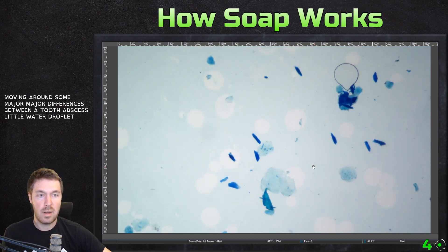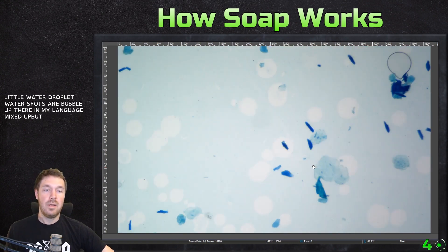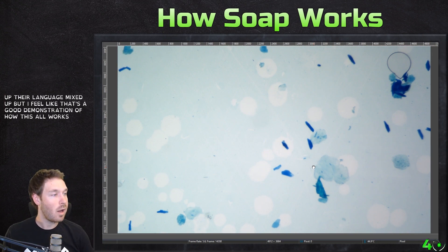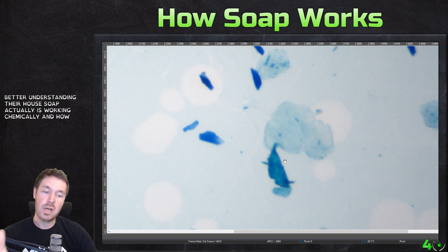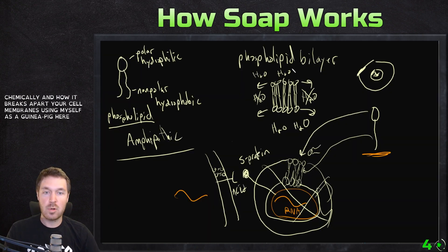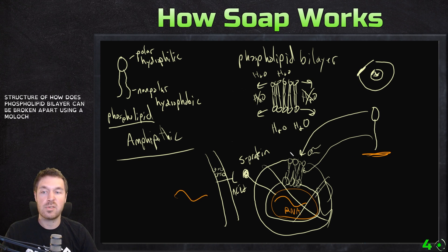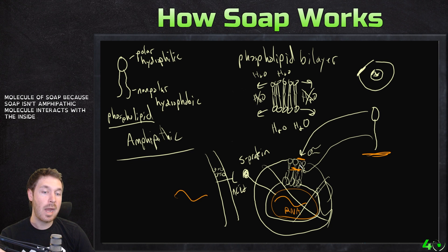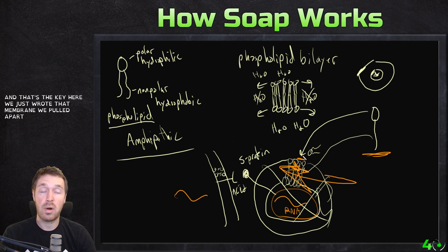I don't see stained nuclei in there as well, which could be disrupting the methylene blue. But if I go deeper into this stained sample, we then get the dark pigments back — and we didn't see any of these in the previous sample. So none of these dark pigments — we're at the same focus, same magnification, moving around. So major, major differences between the two. I feel like that's a good demonstration of how this all works. I hope you got a better understanding there of how soap is actually working chemically and how it breaks apart your cell membrane. Using my cells as a guinea pig, I was able to show this structure of how this phospholipid bilayer can be broken apart using a molecule of soap, because soap is an amphipathic molecule that interacts with the inside and outside, and then disrupts it.